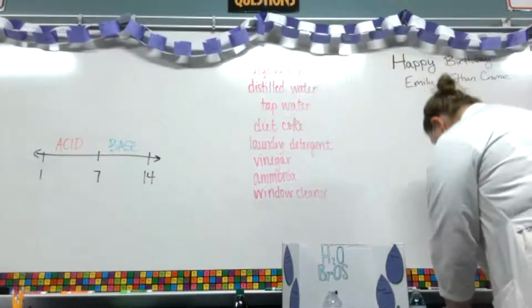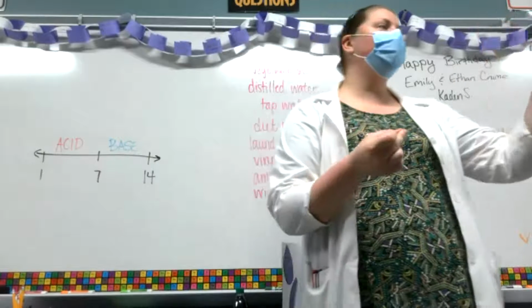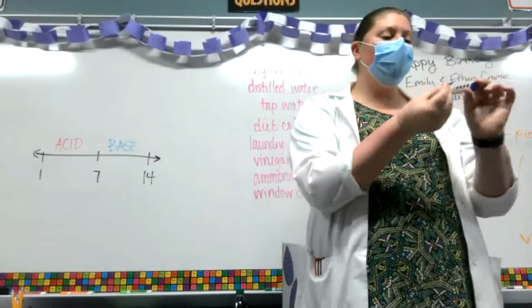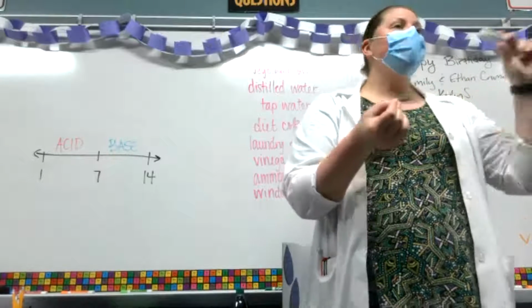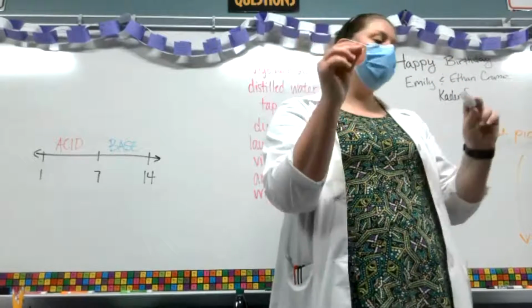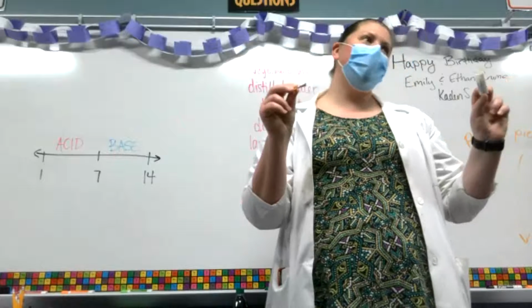The pH strips, the reason why we have them is so that you can compare on the side of the bottle. There is a little legend, and you would hold up the strip to that and determine what color it is. So it's 1 through 12. Yes, I know the pH scale goes to 14, but the paper doesn't change colors after pH of 12. So that's why the highest it goes is 12.